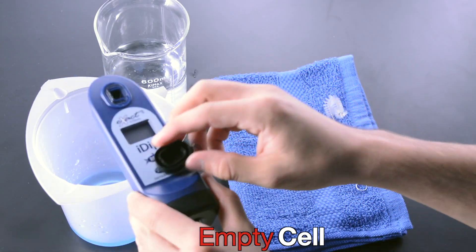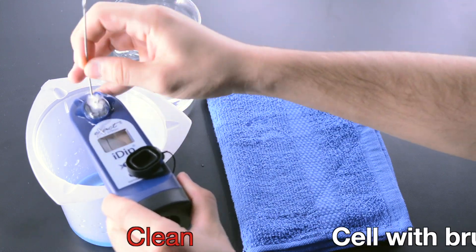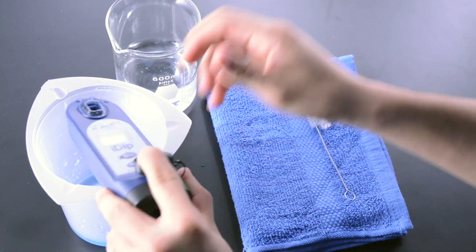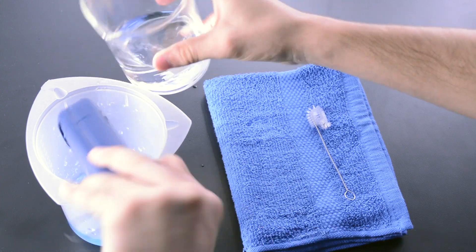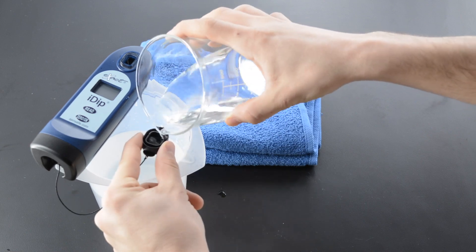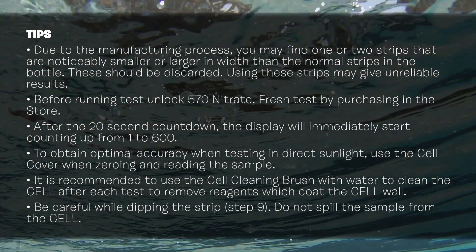Empty Cell. Clean cell with brush. Rinse cell three times. Rinse Cap three times.